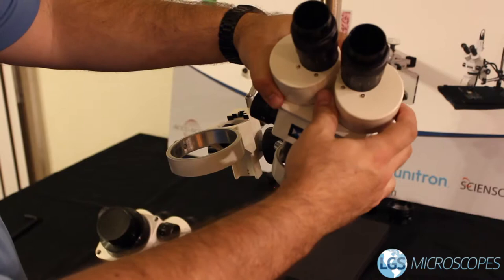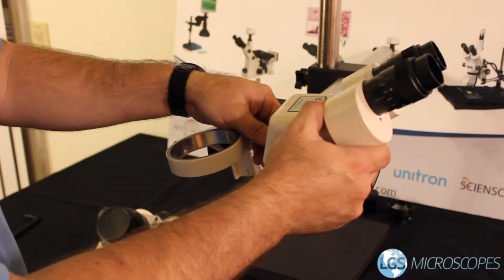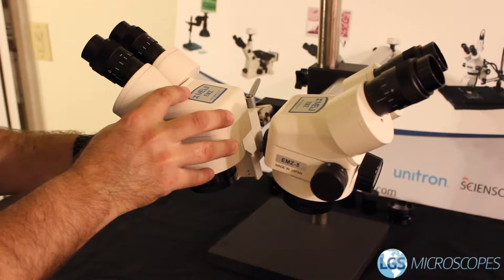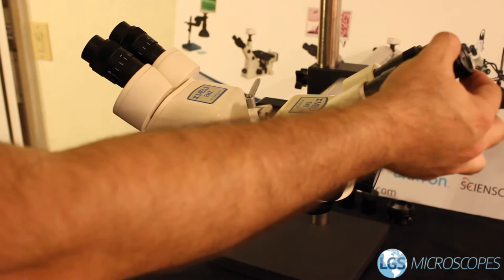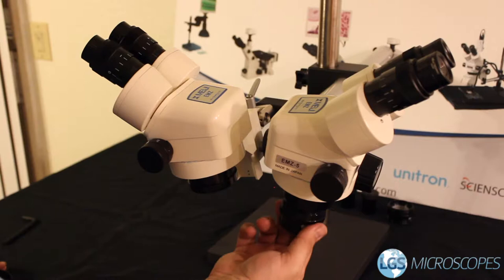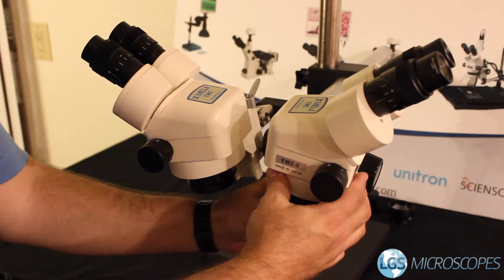Now we'll go ahead and install our zoom body heads. Set the first one in and make sure those screws are not impeding the hoop. These are installed facing a slightly different direction compared to other stereo microscopes. Tighten down the silver knurled knobs, then install the second one the same way. Go ahead and install the eyepieces for both — remove the caps and they slide right in. Be careful handling them afterwards as they can fall out if the microscope is tipped upside down. Finally, take the auxiliary lenses, remove their caps, and thread them into the bottom of the zoom body — just snug, no need to wrench them on.